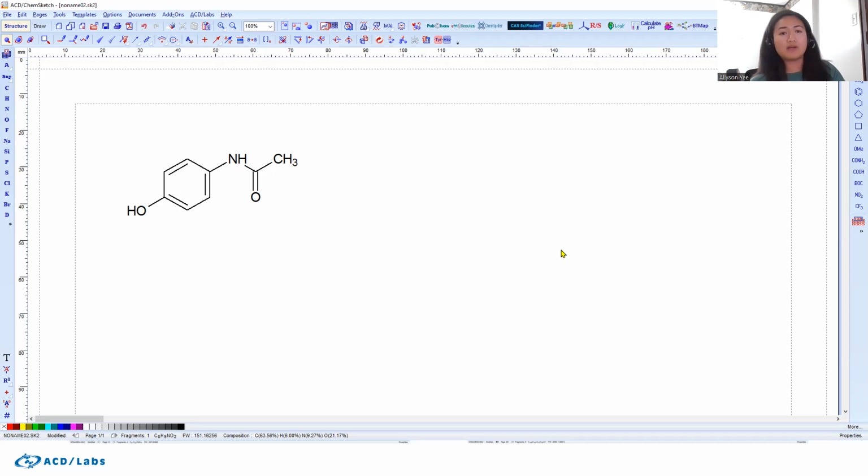And the last thing I wanted to speak about while I was here were the templates. There are two places where you can access the templates. The first place is through the top toolbar over here. You'll see that it has templates right here. If I click that and go into the template window, we can access it through there.